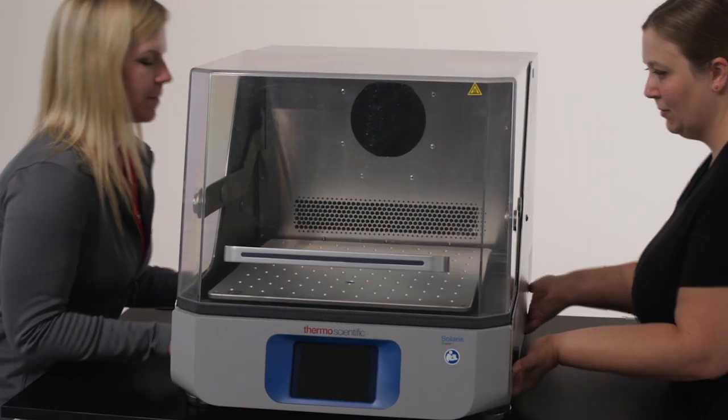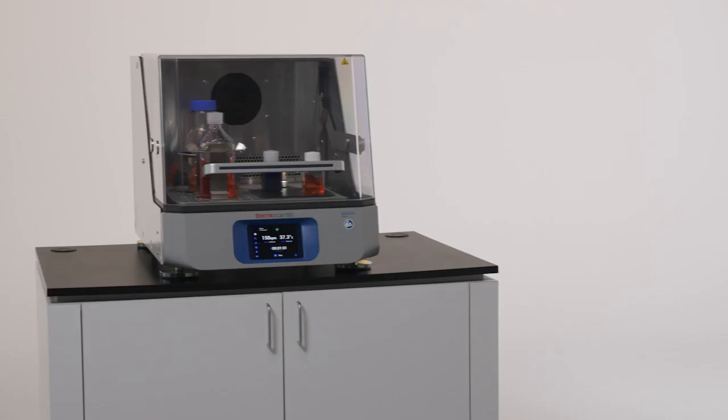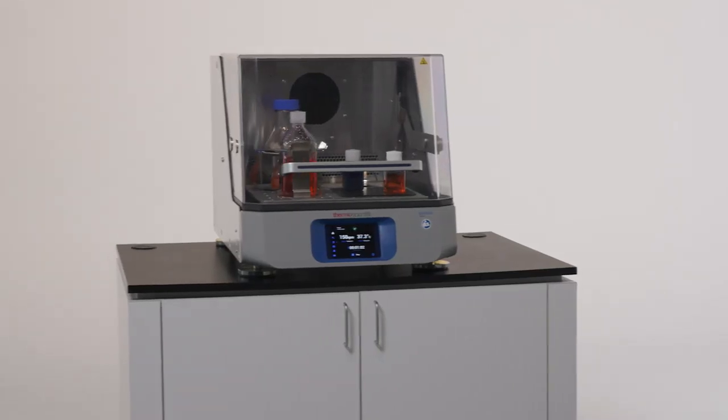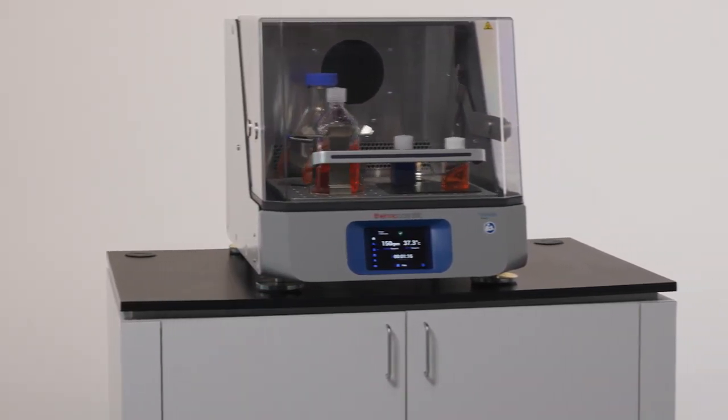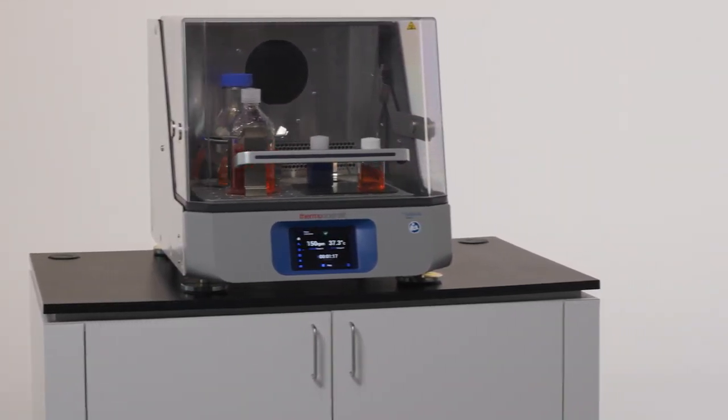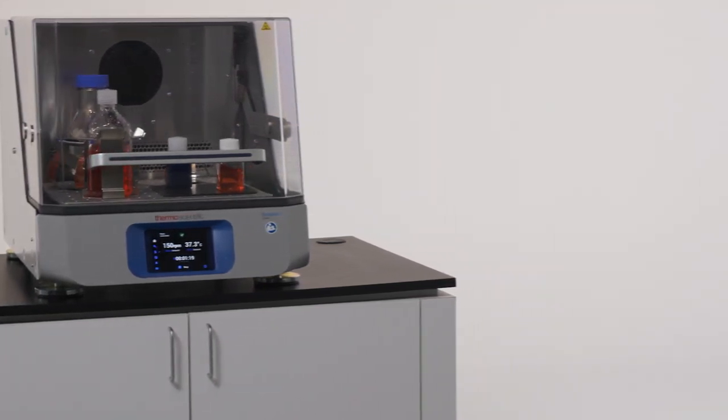It will take at least two people to transport the shaker. Be sure to lift it from the sides and place it on a clean, stable, and level table or bench near an electrical outlet. Allow three inches or eight centimeters of free space on all four sides of the shaker for proper ventilation and optimum performance.